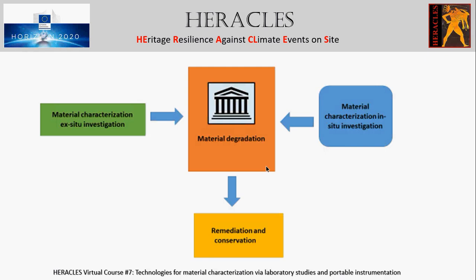And finally, it should be multi-elemental, so that in a single measurement, information on many elements is obtained simultaneously, and more importantly, information on elements which were not initially thought to be relevant for the investigation purposes are gathered.